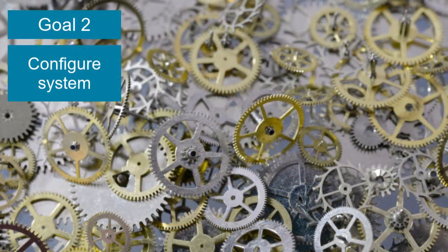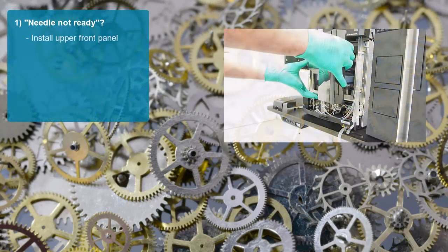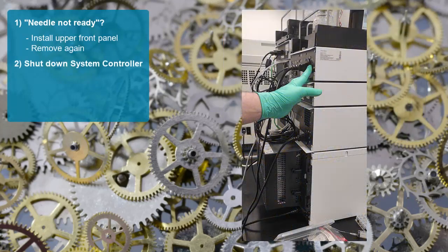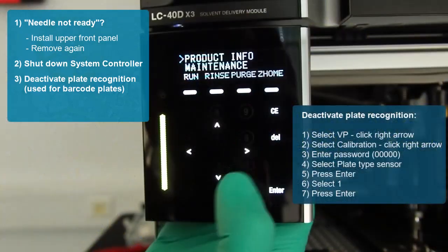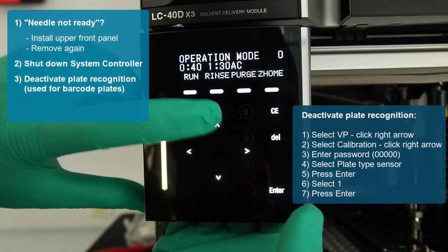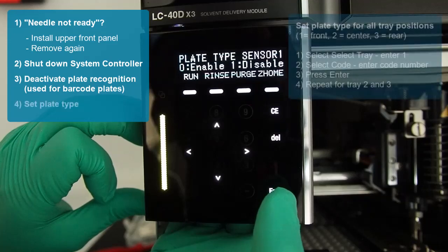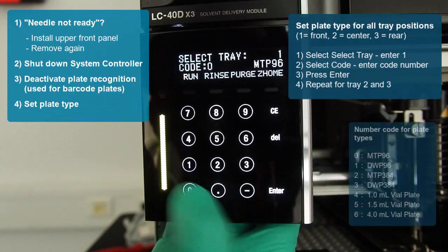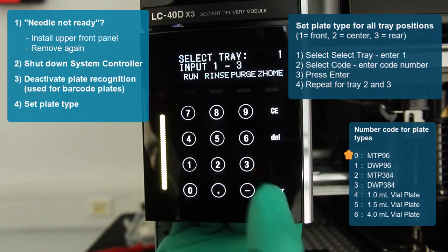The next goal is to configure the system. If you get the message that the needle is not ready, simply reinstall the upper front cover and then remove it again. It is recommended to shut down the system controller as shown. In case the plate recognition is activated, you need to disable it, otherwise the plates will not be recognized. Finally, you need to set the plate type for all three plate positions. Depending on which plate format you want to use, enter one of the following number codes. In our case, we will use zero for the MTP-96 well plates that we are going to teach.